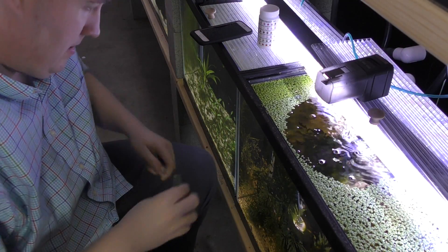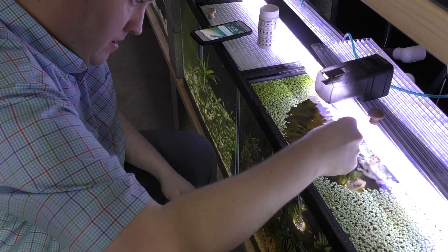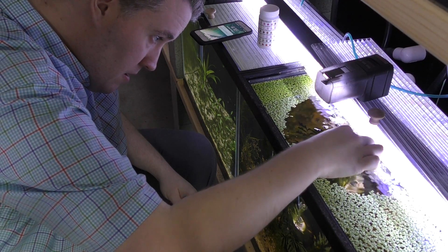I'm not using pH meters or probes or anything like that — just a normal hobbyist. One thing I do want to be clear about: there are some test strips that are terrible. Like API's own test strips — terrible; I think that's part of the problem. I really like Tetra test strips, and the Marine Land ones are the same company as Tetra, so they're the same. I think the bad rap for test strips has come from API's own test strips, which absolutely just suck.